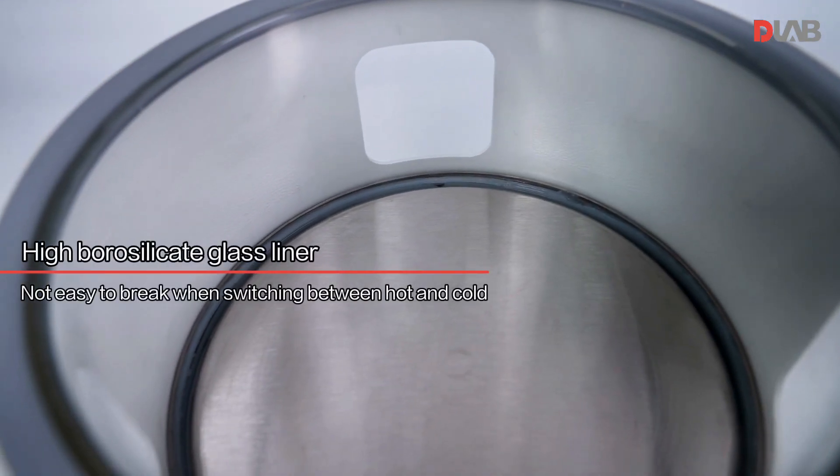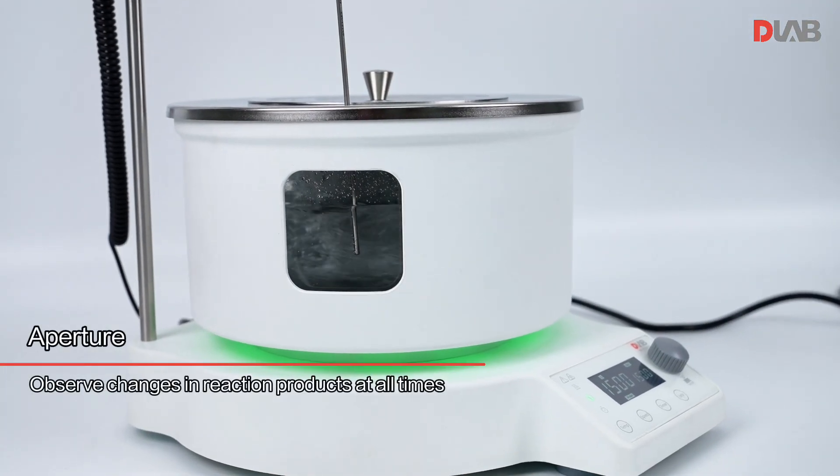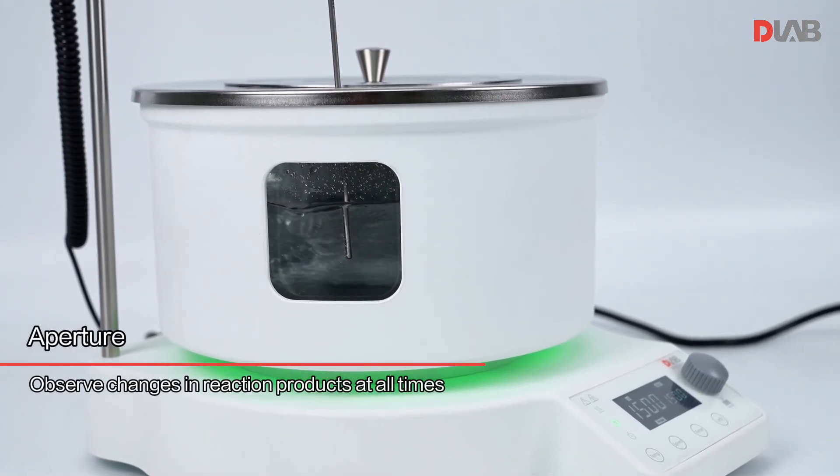High borosilicate glass liner — not easy to break when switching between hot and cold. The aperture allows you to observe changes in reaction products at all times.